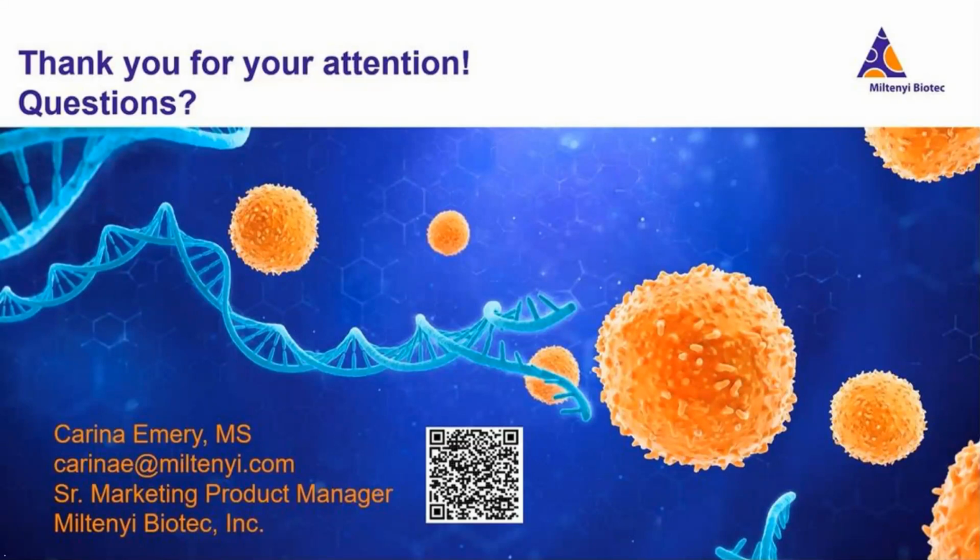So we really recommend using a fluorescent dye to count your nuclei, something that will bind the DNA and light up, so you get really good differentiation between what's nuclei and what's debris, and you'll get a much more accurate count that way. So fluorescent dyes can be pretty much anything you want.